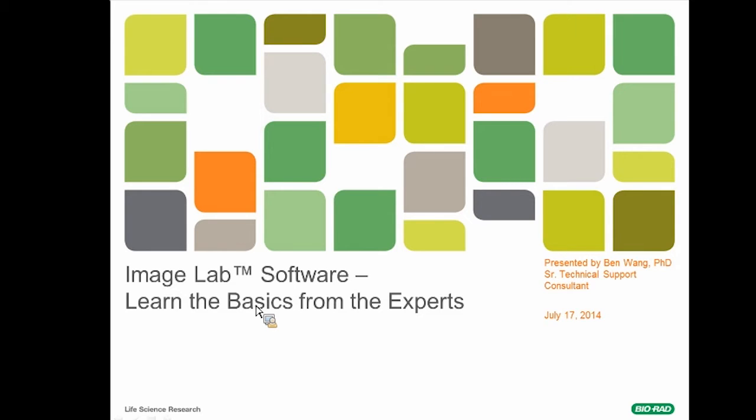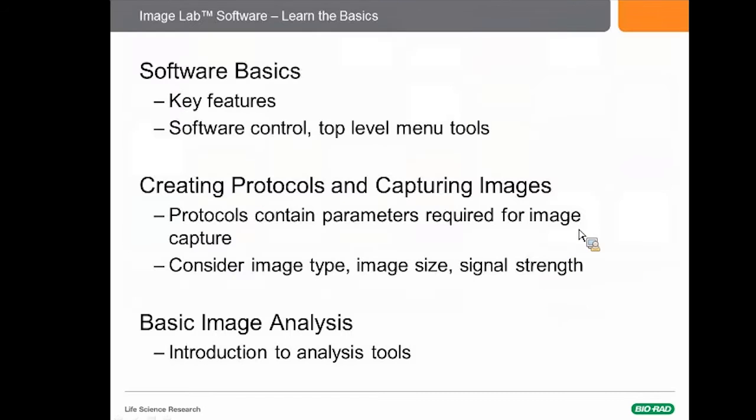The title of our webinar today is ImageLab, Learn the Basics from the Experts. And our goal today is to introduce to you the ImageLab software and to have you follow a few simple steps to become successful in capturing high quality images from your experiments. And we will achieve this by following the list below.